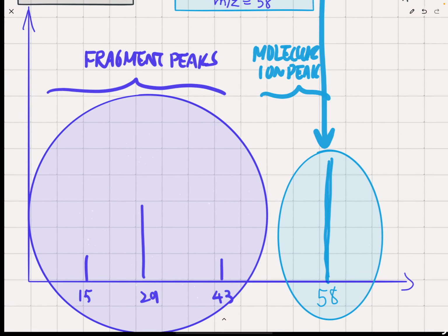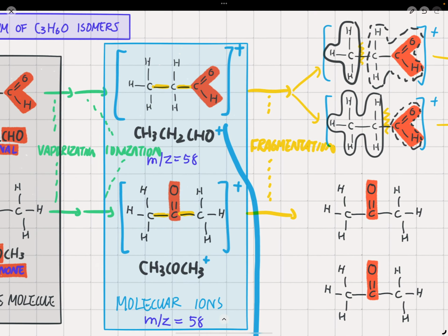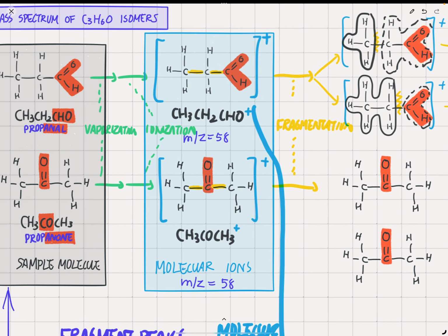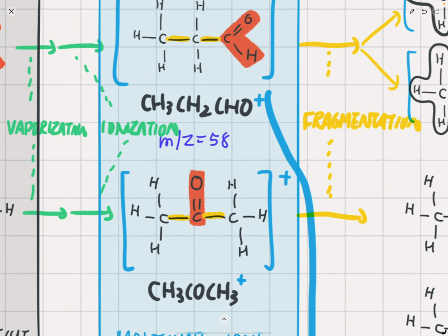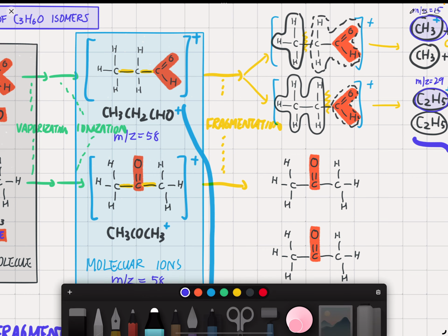It is the pattern that you see in here, how many peaks you see, that helps distinguish between isomers. You'll see. So let's look at propanone next. Propanone has 2 C-C bonds at which the molecule can undergo fragmentation. So it can undergo fragmentation at either this position or this position.